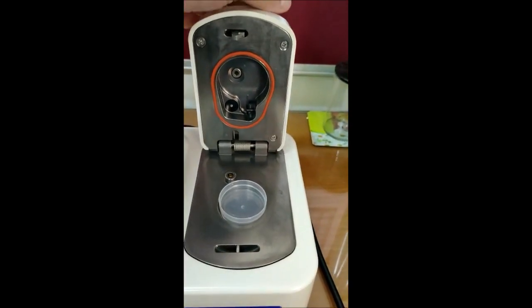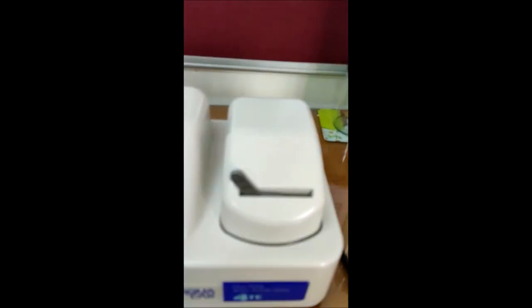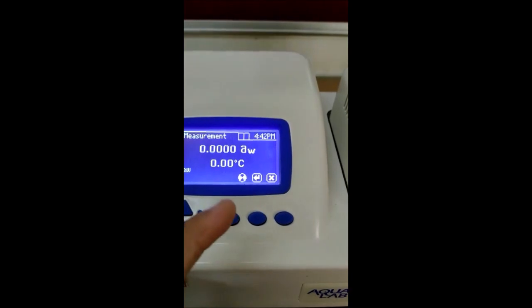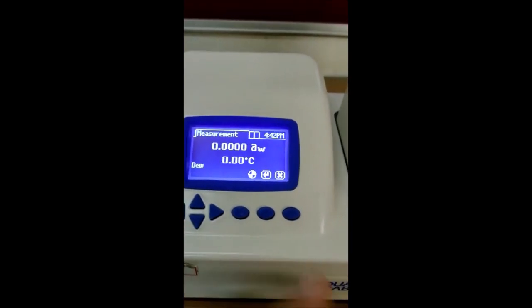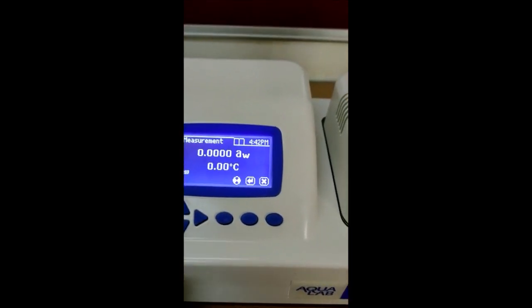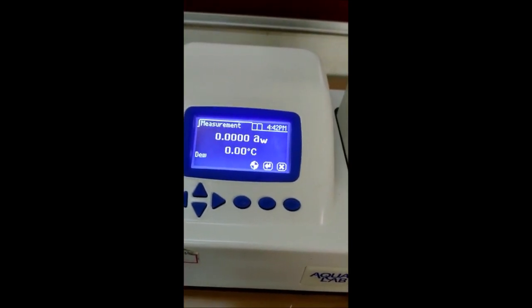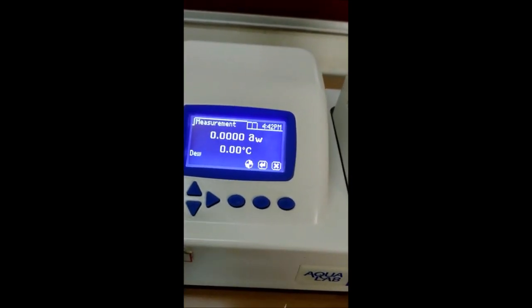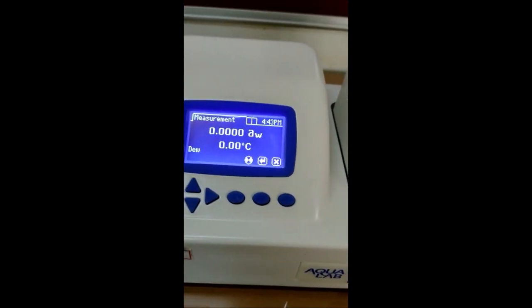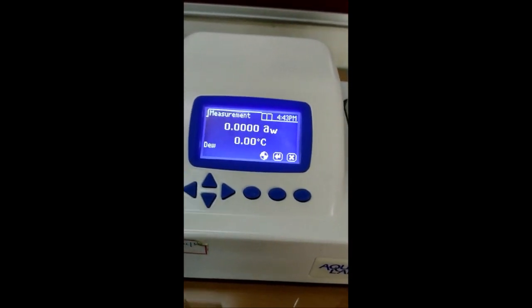Once you have filled the cup you just have to close the chamber and press the lever like this. You will see the test has started and you can see the disk is rotating. Generally the test time should be less than 5 minutes. In single component sample it can be as less as 1 minute or let's say 2 minutes. But maximum time it should take 5 minutes. The test time depends on the sample type. Whether it is homogeneous and it has some preservative added, it is oil based or something. It all depends on sample type.